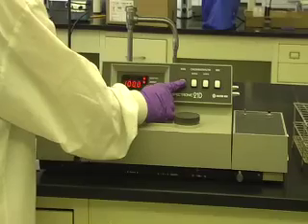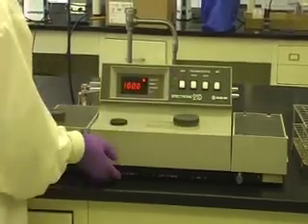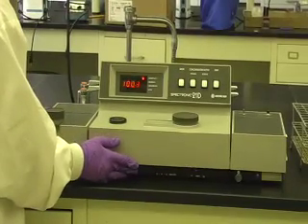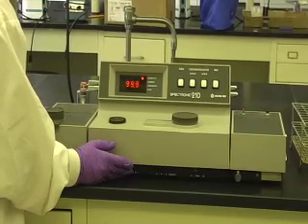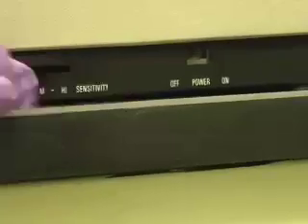Use the mode selector, the first button to the right of the digital readout, to select the operating mode: either transmittance, absorbance, or concentration. Set the sensitivity switch to low. The sensitivity switch is located along the bottom edge of the machine, to the left of the power switch.